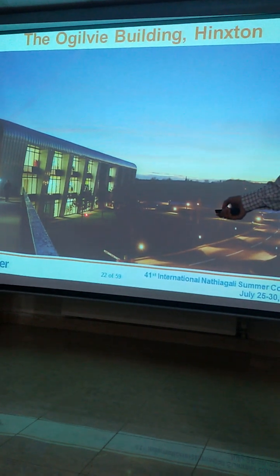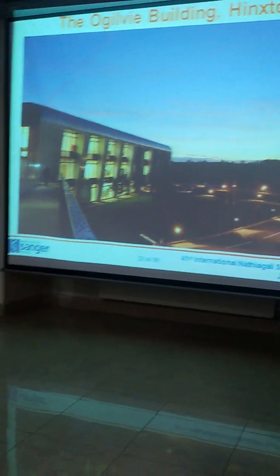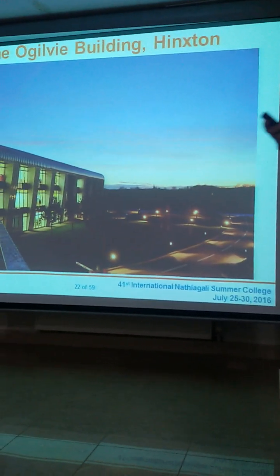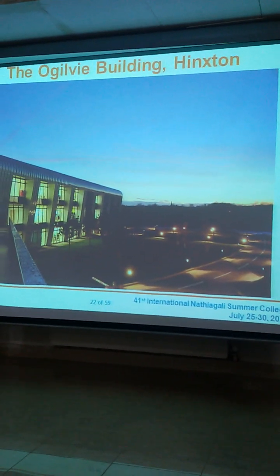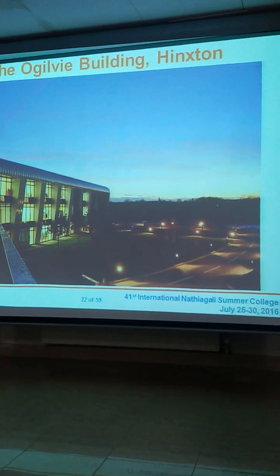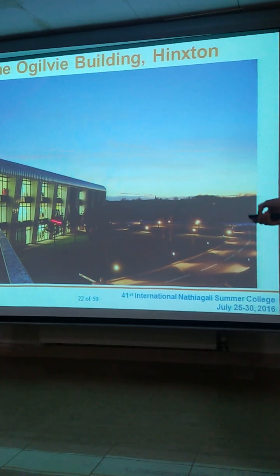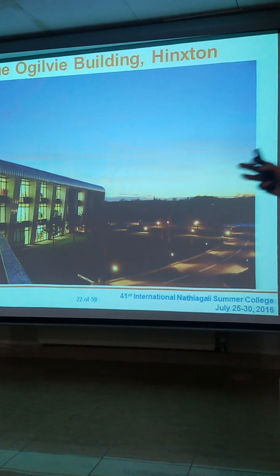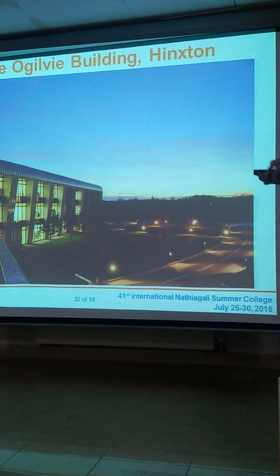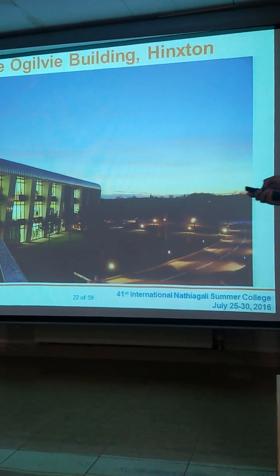And this is the headquarters for Genomics England, which is a big sequencing project in which they're sequencing 100,000 human genomes for the National Health Service in the UK. Because it's patient data, it has to be managed access. They set up this whole new sequencing laboratory, and it has 6 sets of X10 machines, which is like 60 machines. It makes it one of the largest sequencing centers in the world.